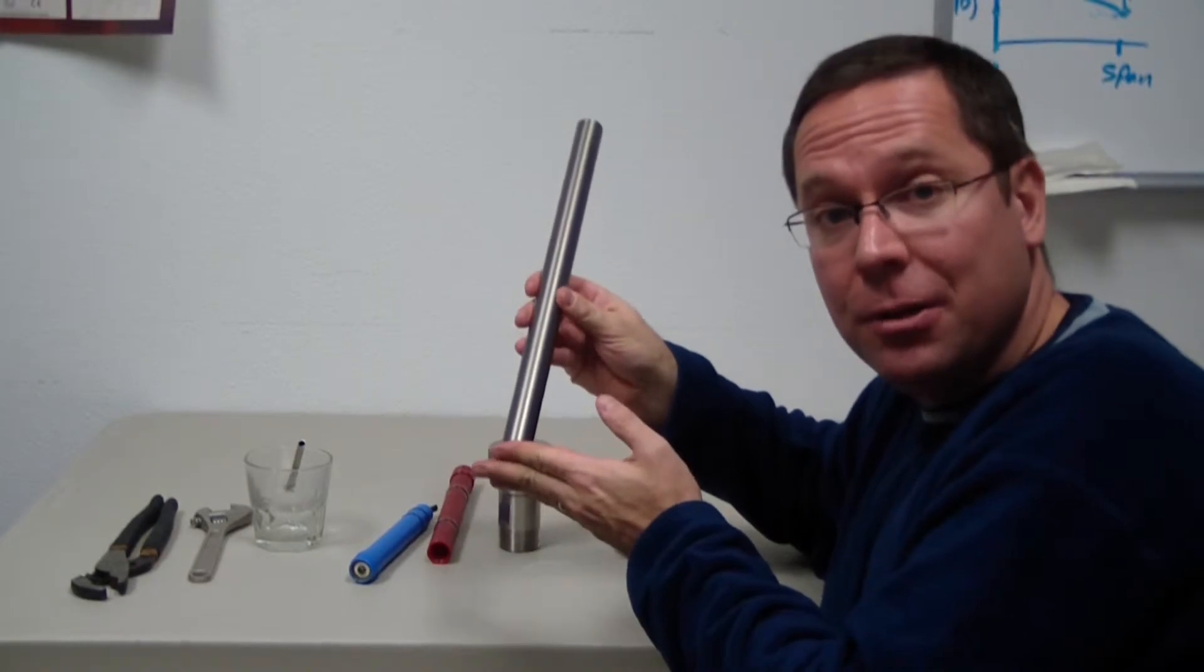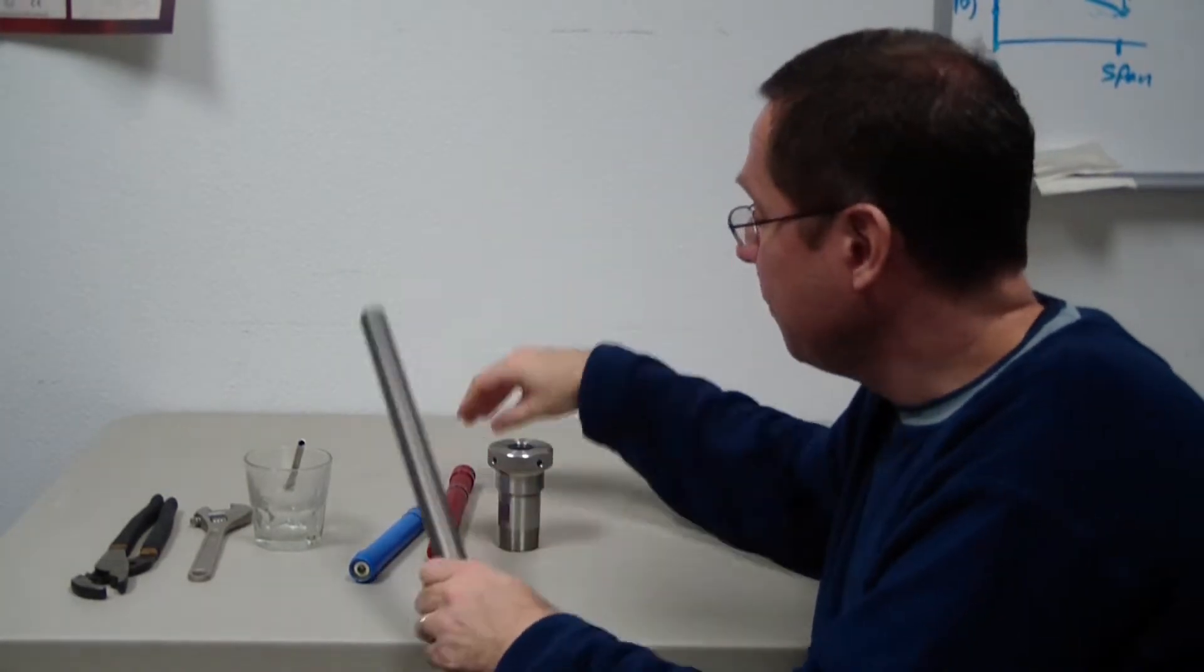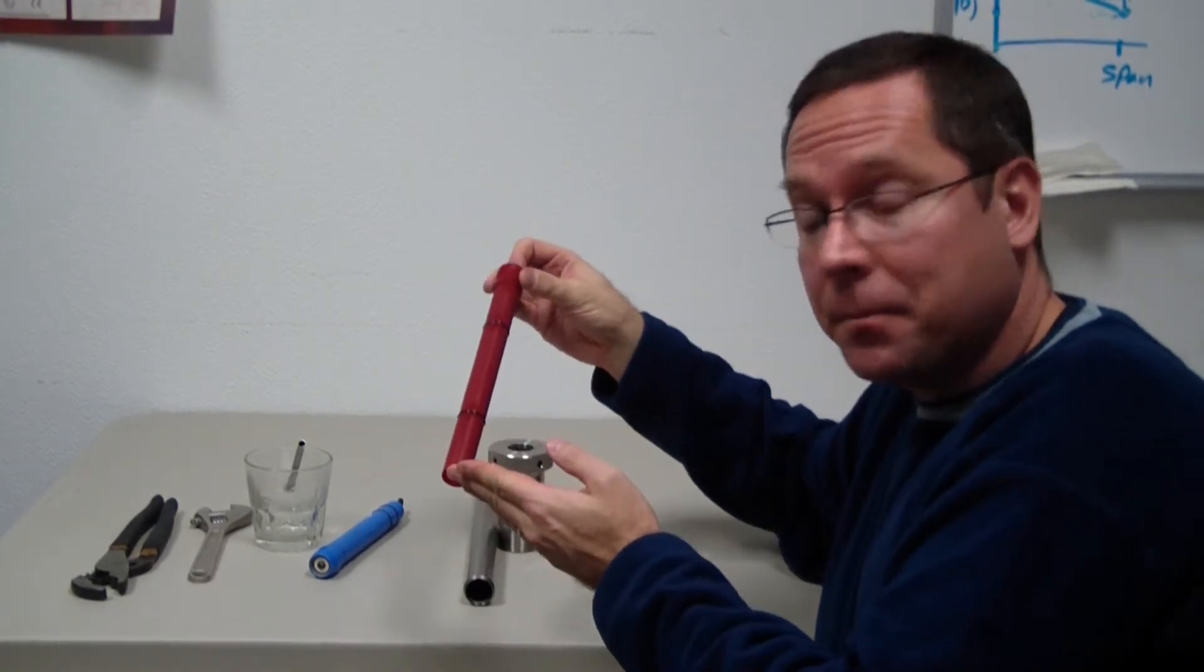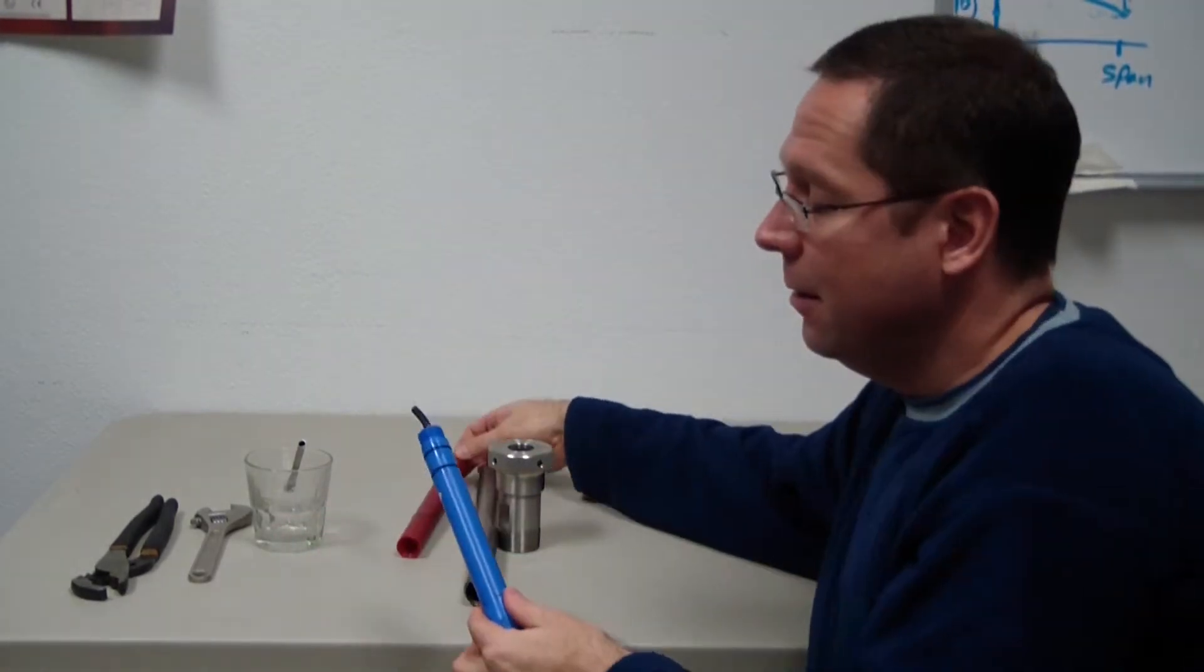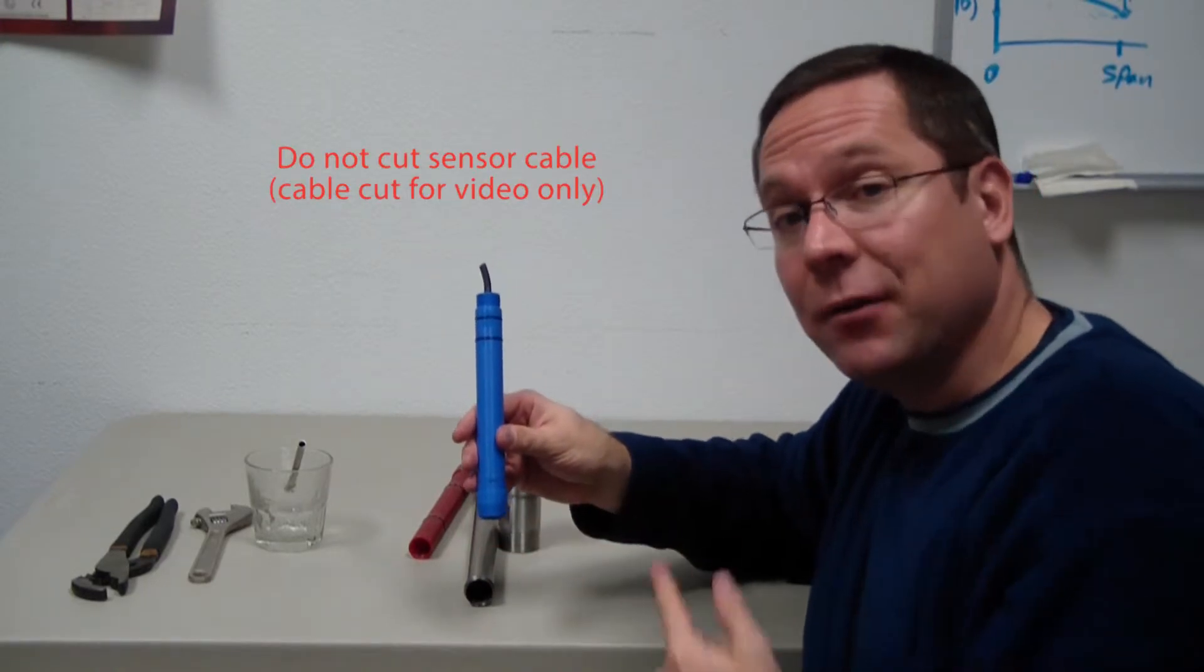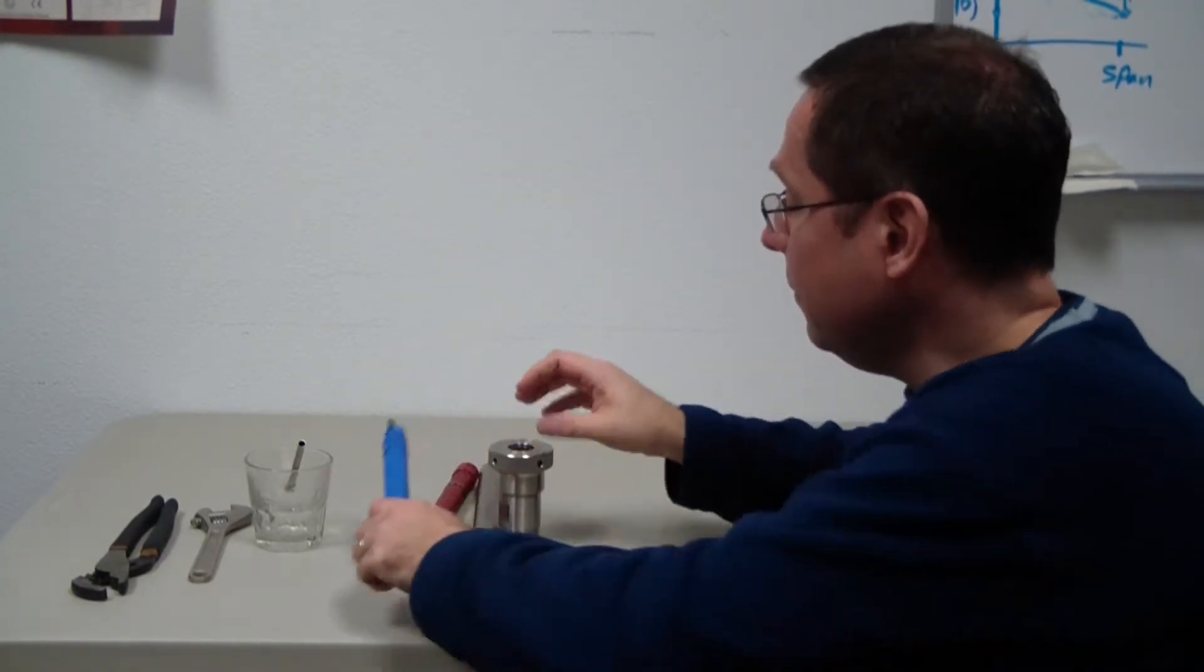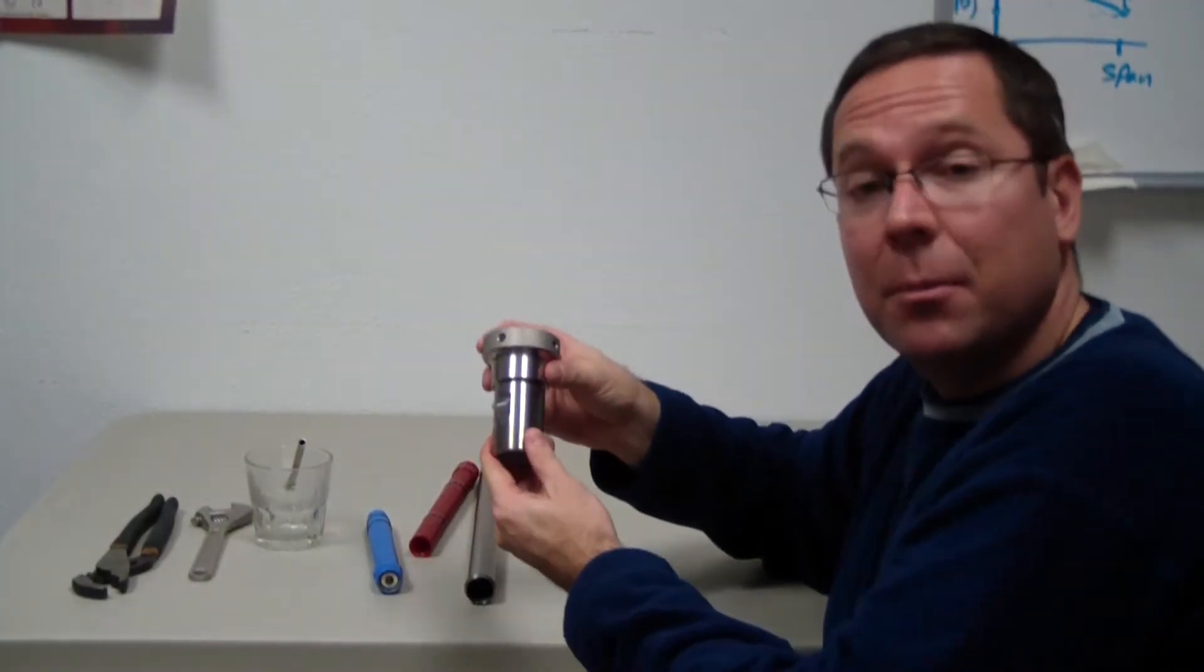I also have the metallic sheath that the sensor fits into, the back piece assembly, the pH sensor, and in this case I've cut the cable off on the sensor to make things go a little quicker, and a compression fitting.